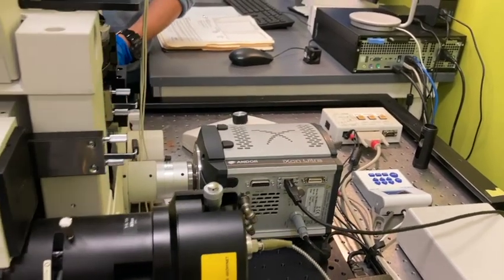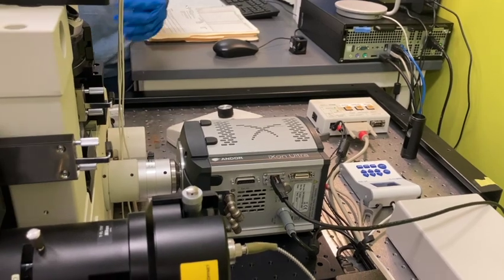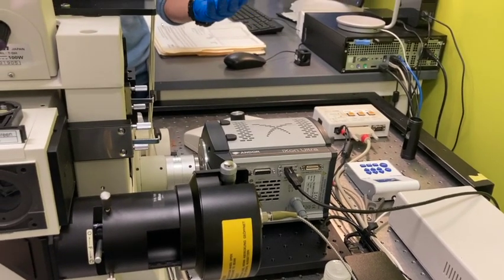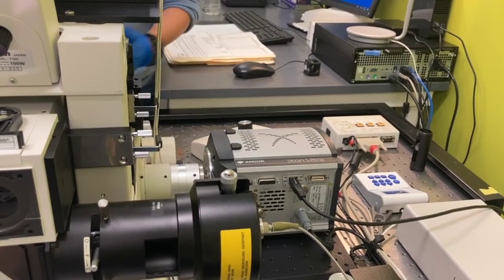Moisture will build up in the chip and it will damage the chip. But if you turn off the cooler and let it go back to room temperature and equilibrium, when you turn the power off, there's not going to be any water.